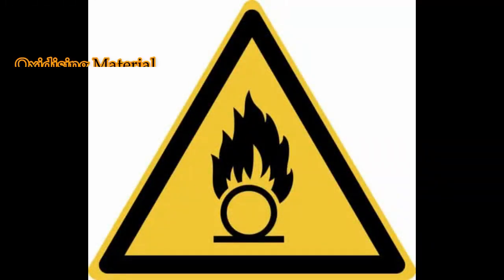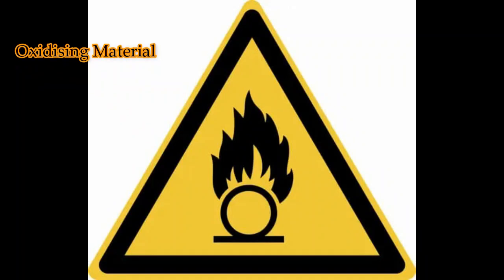Oxidizing material. At a glance, this sample indicates the presence of oxidizing materials such as bromine, chlorates, nitrates, perchloric acid, and peroxides. Stay safe. The oxygen made by these materials can increase the chance of fire or explosion, and some will have toxic and corrosive properties that can be harmful to the skin. Take added fire safety precautions and wear personal protective equipment such as gloves, goggles, and face shield.